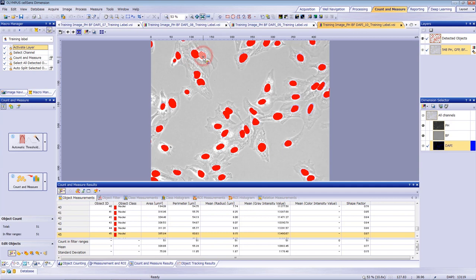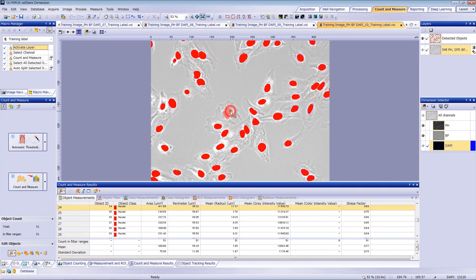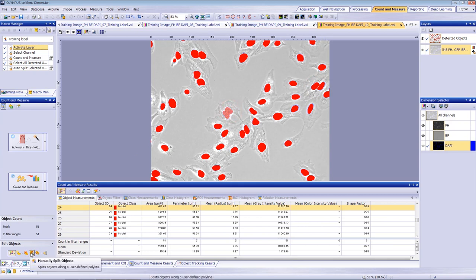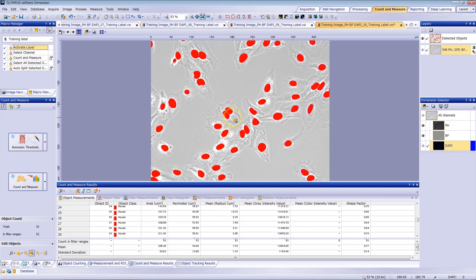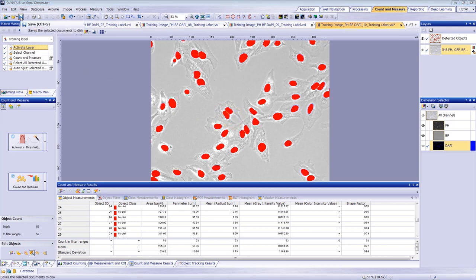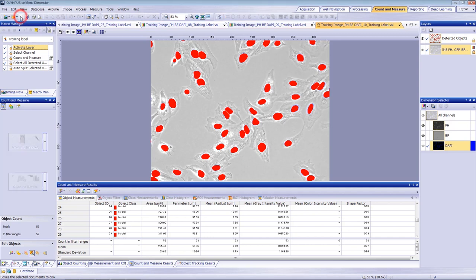It's good practice to quickly verify the quality of the nucleus identification and splitting. If an object is not properly split, please do so manually. Don't forget to save the image if you modify it.